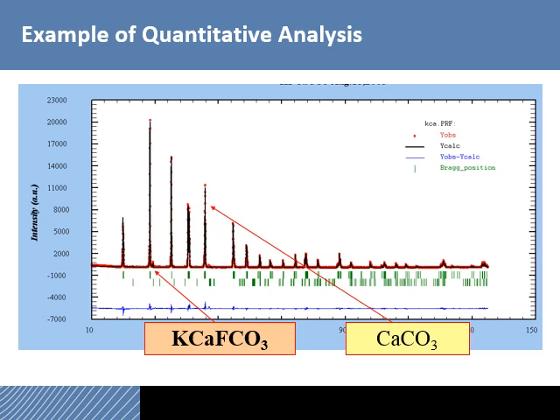You sort of see two plots in here. You see a series of red dots, which is your observed or experimental diffraction pattern. So that's the pattern you generated. And then you see a black line plot, which is the calculated pattern using the structure files that you would have gotten out of one of the databases.